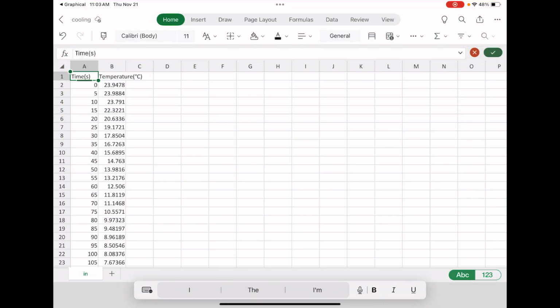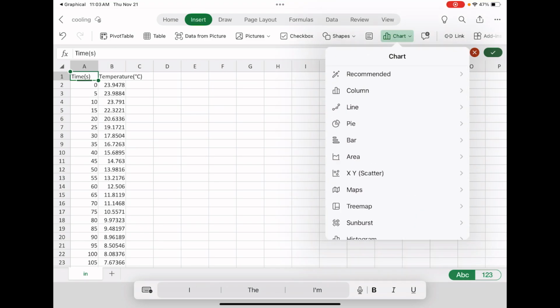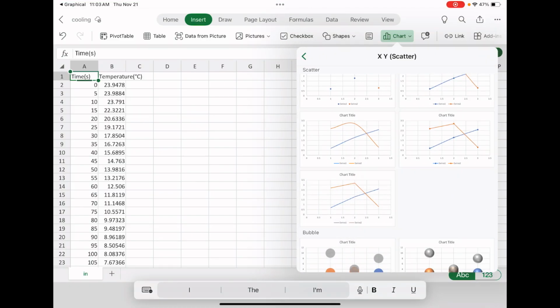Just make sure that if you're pasting it into a Microsoft Word document, I know what this data is. I know where this data is from and what I'm going at if I'm going to click at it. In addition to that, you can use Excel to make a graph. You're going to click Insert. It's called a chart. We probably would like it to be a scatter graph is a nice place to start.